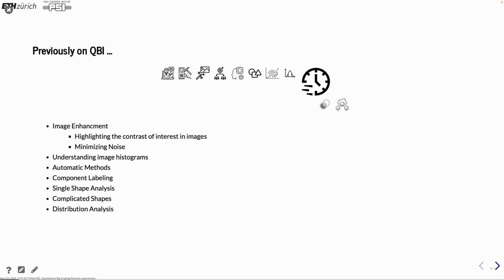All these are tools that we can use in the time series analysis. In the end, you have to extract some information of these time series. Could be that you want to look at grains or cells changing size or moving around. And with that, we come into a topic where we want to identify these between the different time frames. All this material will come in as tools on the way for doing this.